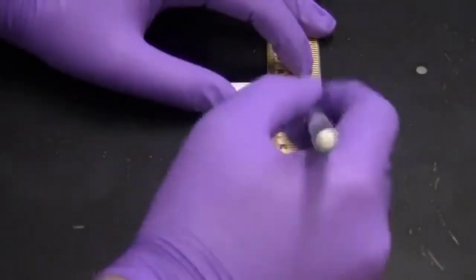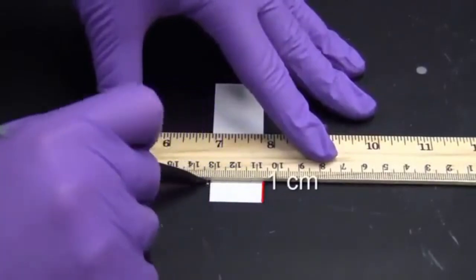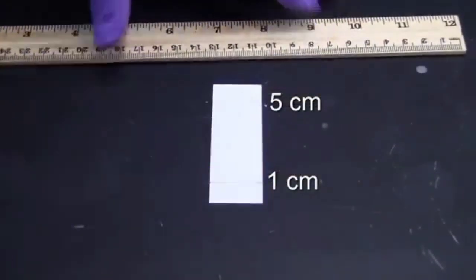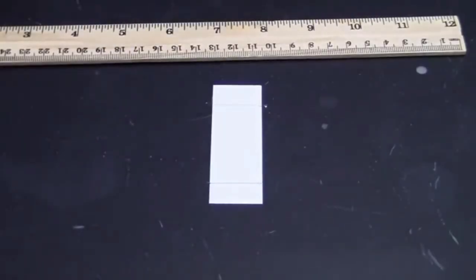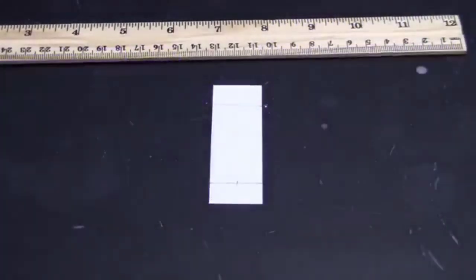Using a pencil and ruler, draw a line 1 centimeter from the bottom of the plate, then another line 5 centimeters above the first line. These lines indicate your start and finish. Draw the lines lightly to avoid scratching the silica off of the plate. Next, make a small tick mark in the center of the start line. You will need a tick mark for each sample.